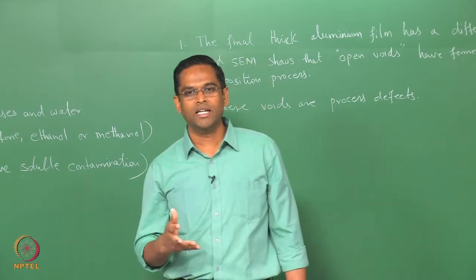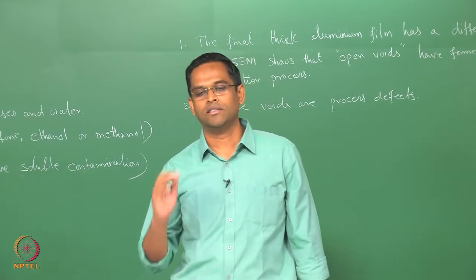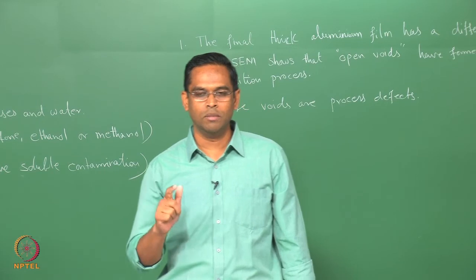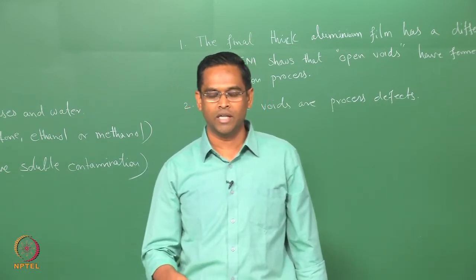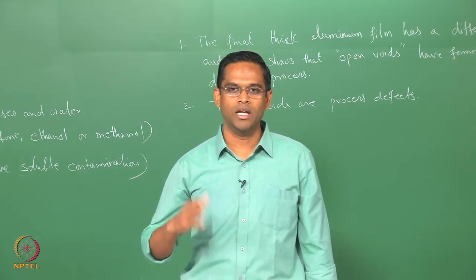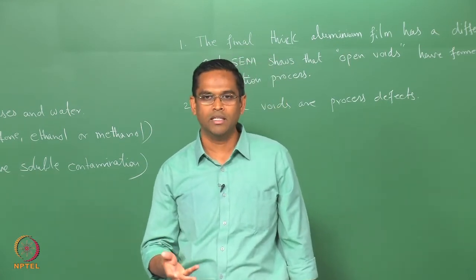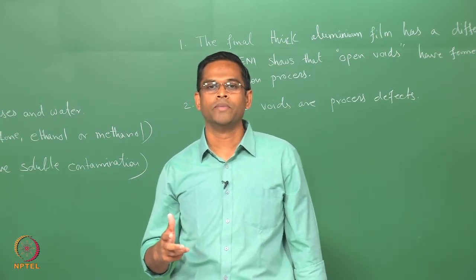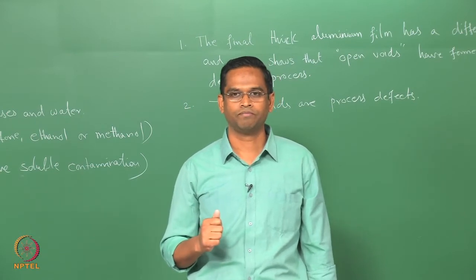But if you want to say that it is a segregation, then you need to have solubility data and then say that it is segregation. That is another issue. Similar points can be made on the calcium peak observation. The same argument applies: it could be a segregation, or the quantity of calcium on the grain boundary may be higher than inside the grain. So, that is another way of looking at this spectrum and how to interpret it.